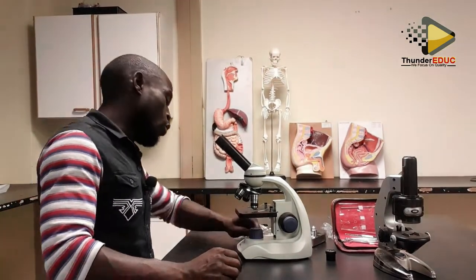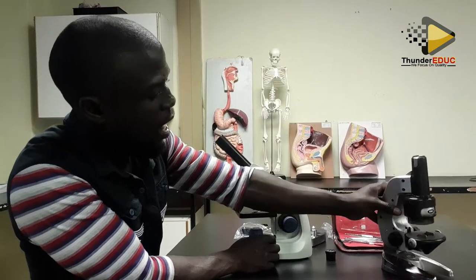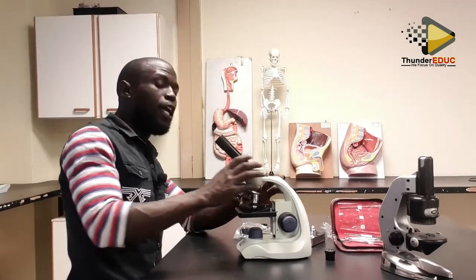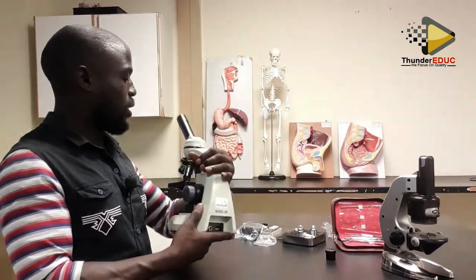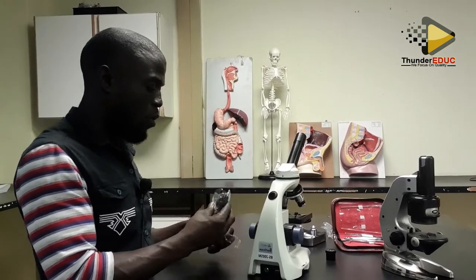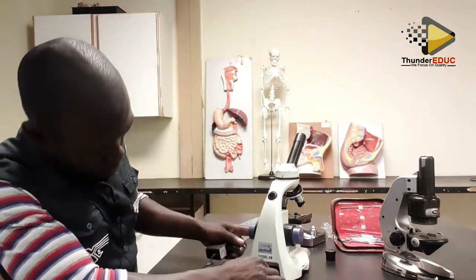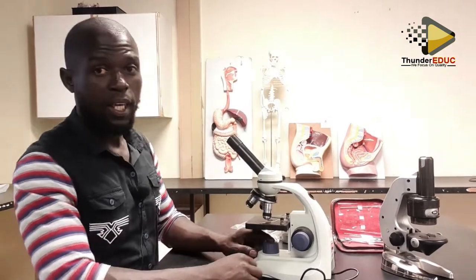Now, where is this microscope going to get the light? You have two options. You either use a bulb, or some microscopes have a mirror which reflects the light into the microscope. But this one, you can use with electricity or with batteries. When you use electricity, you plug it in here. This is the cable which goes in, and then you plug it in here. When you plug it into the electricity, light is given out here.